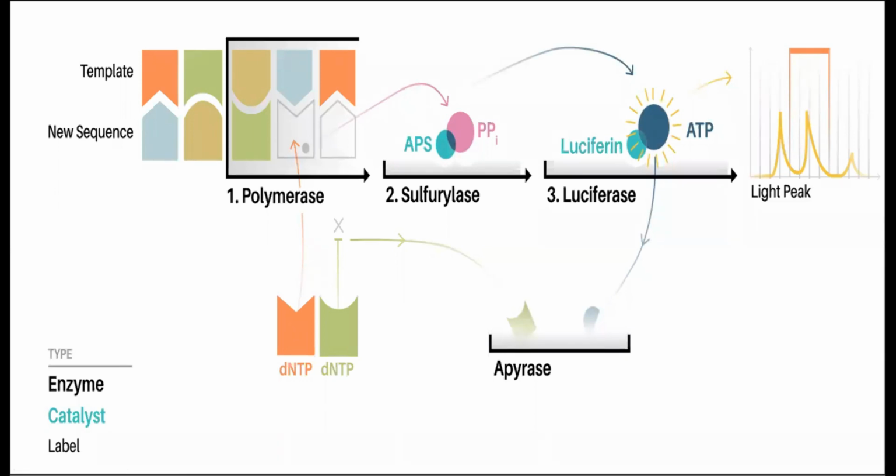Now, once you have your adapter attached with your double-stranded DNA sequence, then you cleave the double-stranded DNA sequence and prepare your single-stranded DNA sequence. Now, once your single-stranded DNA sequence is ready, you have a structure which is basically your single-stranded DNA sequence attached with an adapter molecule over here, right?